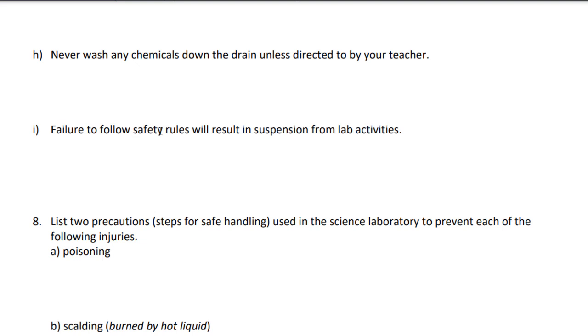This is also somebody who's not wearing their goggles. If you're not wearing your safety goggles when you're supposed to, I'm going to ask you to sit it out. Now, because you're still learning and you guys are new to the lab, I'll give you fair warning and I'll remind you. And then if I have to keep reminding you and I don't think you're safe in the lab, then I'll ask you to sit it out.